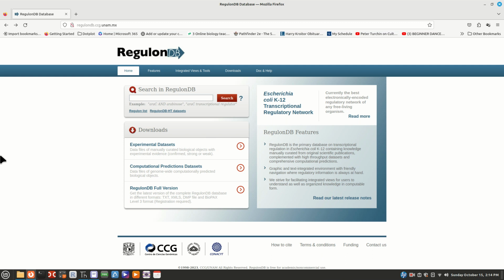Alright, in this video I'm going to teach you how to assemble your larger sequence from maybe smaller parts. Maybe you can't find all the exact parts, plus of course you have the problem of needing the intervening parts. Say if it's the lac operon like here, you need that part between lac I and lac Z, and between lac Z and Y, and between Y and A, and then maybe some sequence after A also. So you need those extra pieces, and I'm going to show you how to do that with RegulonDB, and then switching over to the NCBI to get the bigger picture.